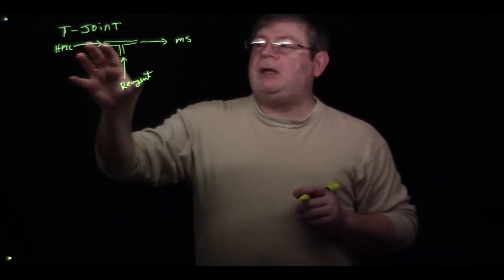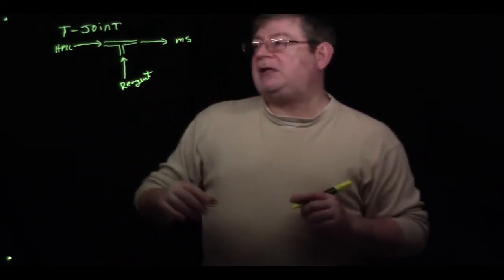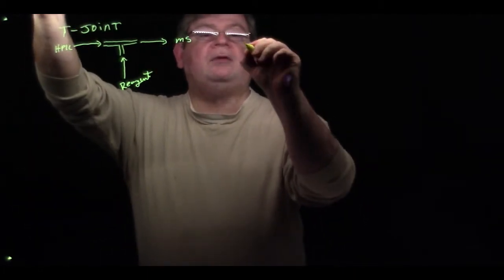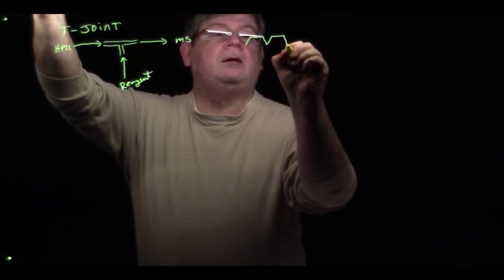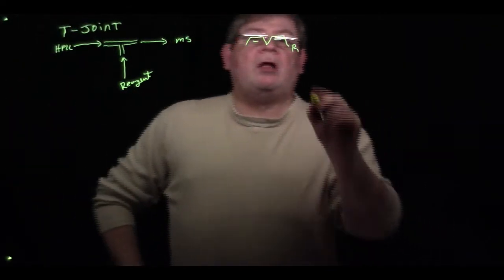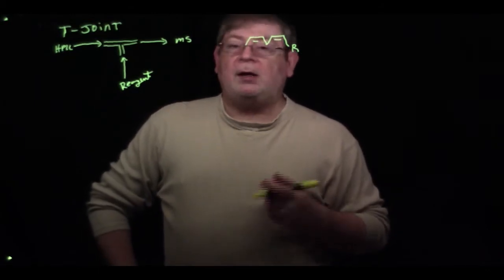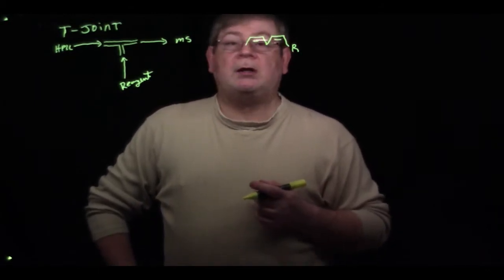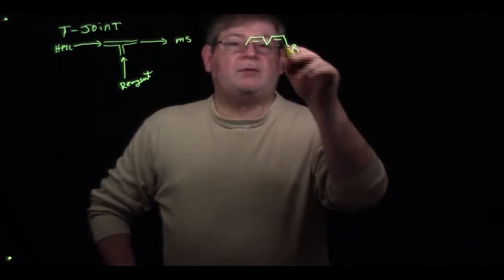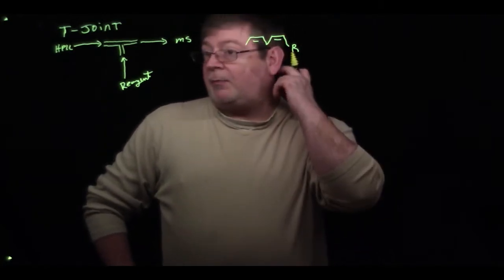This type of experiment can be done for a variety of different purposes, but one of the things you can do is use it to detect things that otherwise would be difficult to detect. Let's suppose we have a molecule that has some double bonds. Otherwise it's just a pure hydrocarbon. It's not polar. It's low molecular weight. It wouldn't be feasible really for MALDI for the most part. Electrospray ionization is not going to easily detect it because there's really no place for it to pick up a good charge. You might be able to do APCI, which is definitely a possibility.